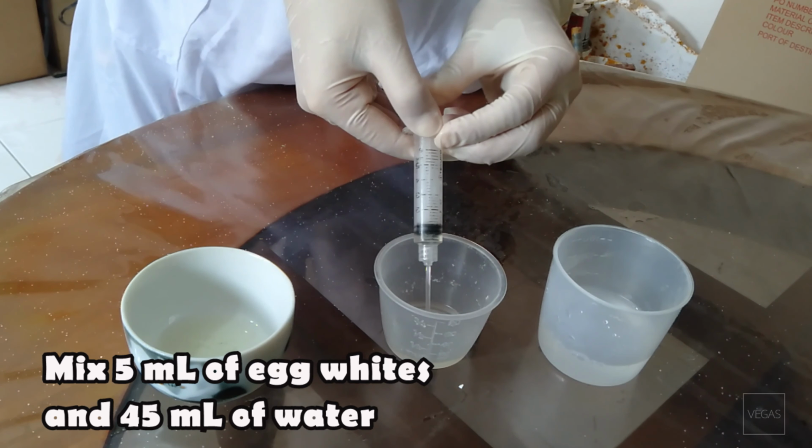For experiments 3 and 4, we'll be using the egg albumin solution. Mix 5 ml of egg white in 45 ml of water.